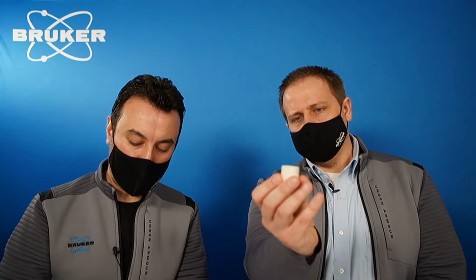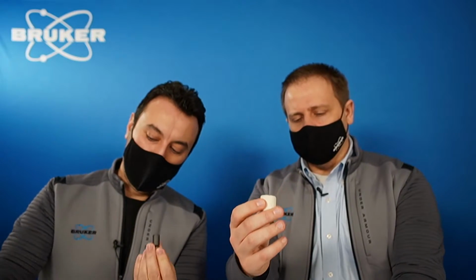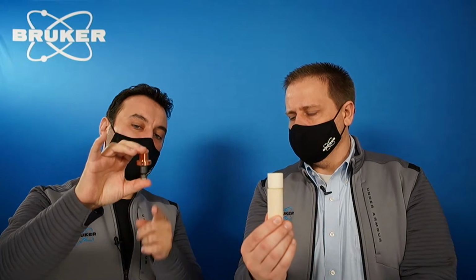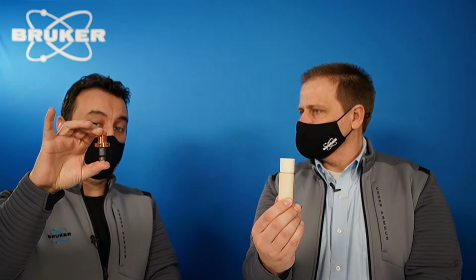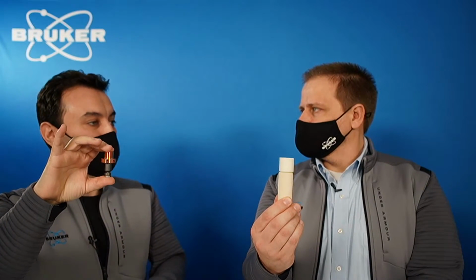And I understand there's also a difference in the actual crucibles that we're going to be using for these. Yeah, for the combustion analysis, we use this kind of crucible. Okay. These are ceramic crucibles, and for inert gas fusion, we use graphite crucibles, which sit on top of the lower electrode. And on top of the crucible, we have the upper electrode. So an electrical current passes through this graphite crucible. Depending on the application, we can go above 1000 amps. And it heats up the graphite crucible instantaneously. And then the sample is dropped in the hot graphite crucible, and it melts, and it releases those gases. So this one, we have this inert ceramic.